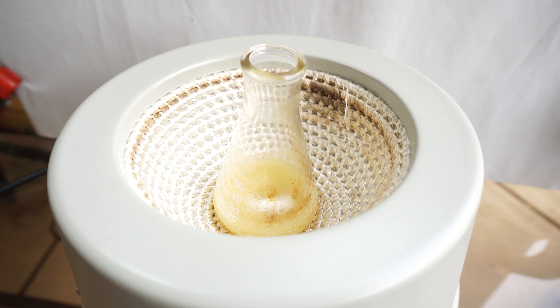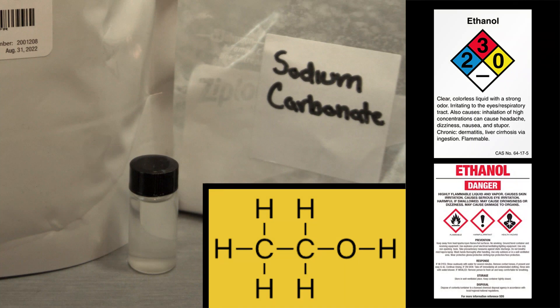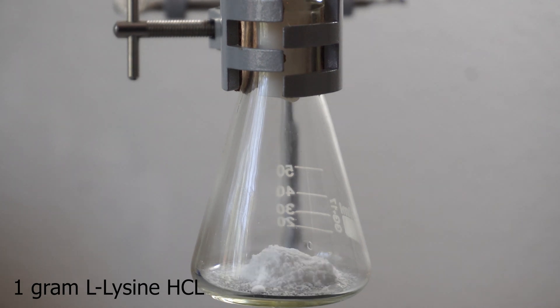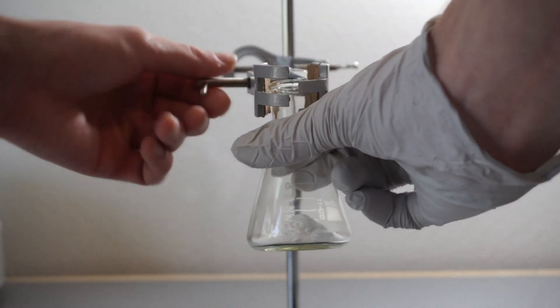We will need sodium carbonate, ethanol, and lysine hydrochloride. We will start by adding 1 gram of lysine hydrochloride to an Erlenmeyer flask, followed by adding 0.5 grams of sodium carbonate. We will remove the flask from the clamp to hand mix it. It is important that these powders are fully mixed.